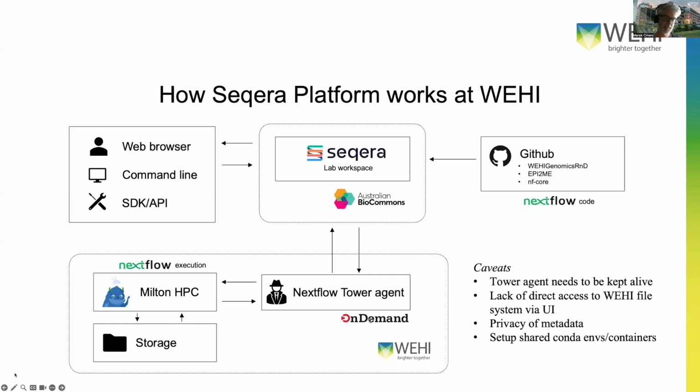Previously, this had to be done via the command line, but we were able to figure out a way around that. And so the lab techs don't need to use the command line at all for this service, which is great. There's a lack of direct access to the WeHi file system, so we can't browse files or anything. It probably would be difficult due to security considerations, but we were able to make it work with some pre-configured paths, and then the users would just paste their run path into that argument.